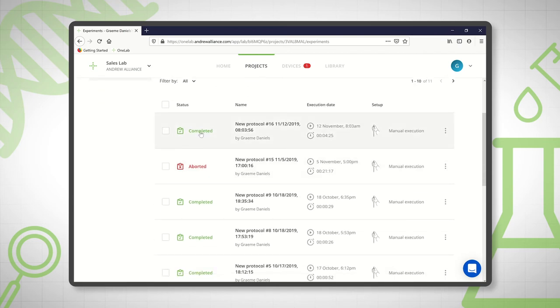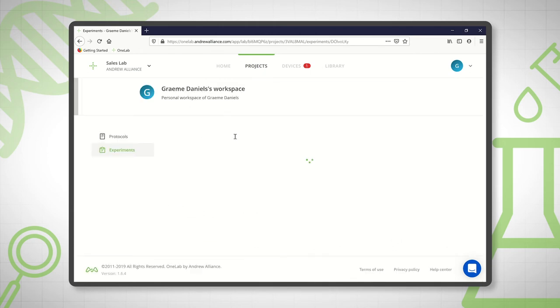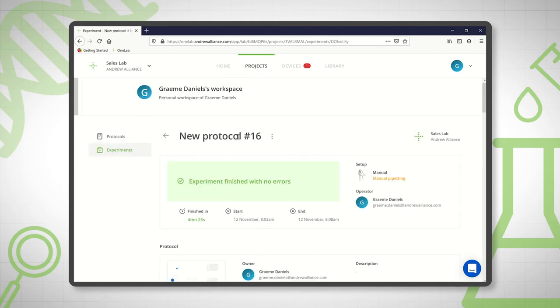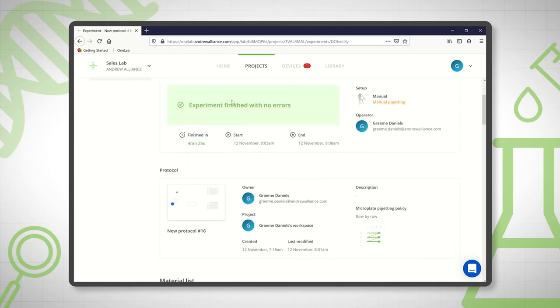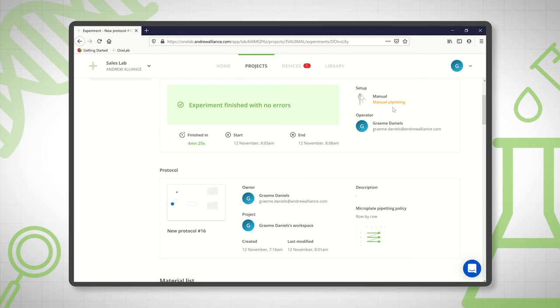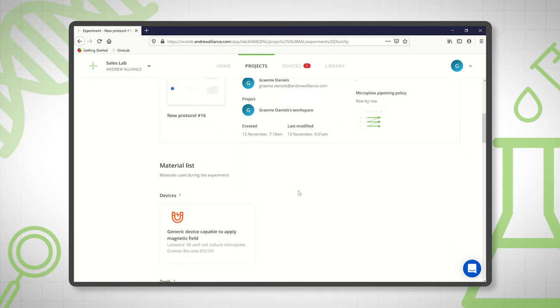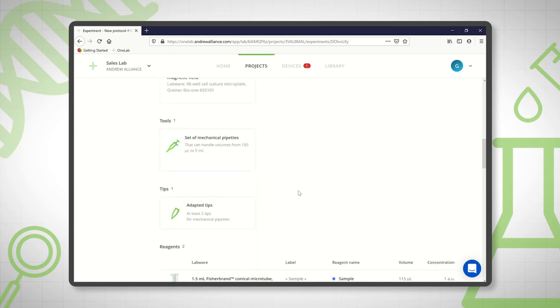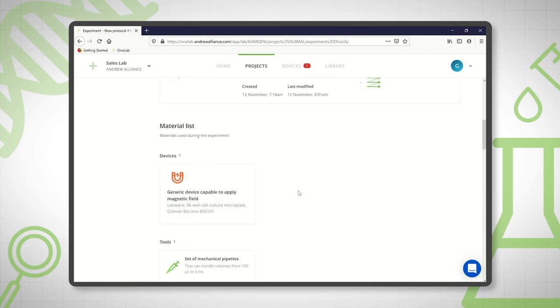If I click on a particular experiment what I then get is the experiment report. So it tells me that it was finished with no errors, how long it took, when it was run, who operated it, what mode it was operated in and then you get the experimental details.